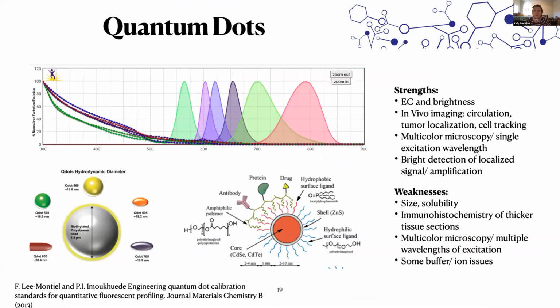Oh, Q dots. That was my entire last year at Invitrogen, going to people's labs who were doing 18 color flow cytometry and conjugating their antibodies for them. I'm not sure if I'm ever going to have a love-love relationship with quantum dots, but they have an amazing extinction coefficient. They're just little semiconductor particles. They're going to keep absorbing energy, and they're just going to keep chugging along like a little motor, because that's really what they're good for, which means a high level of brightness, of course.